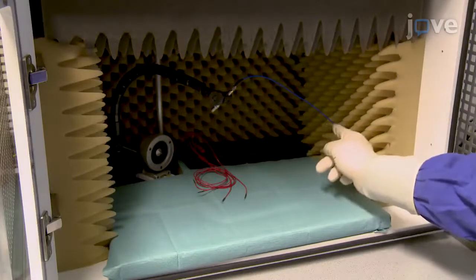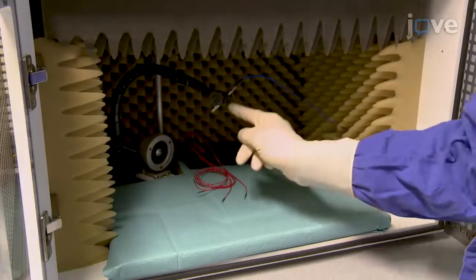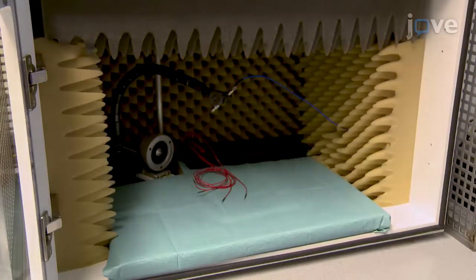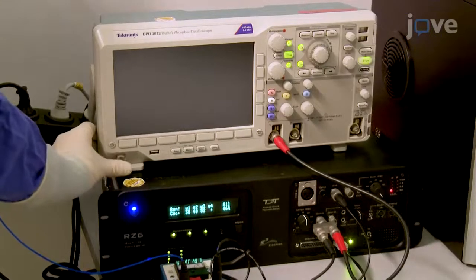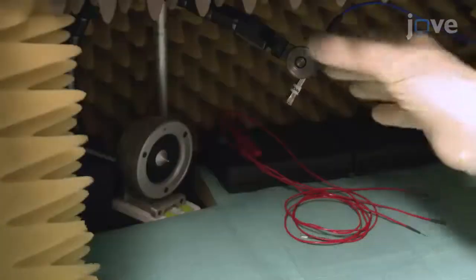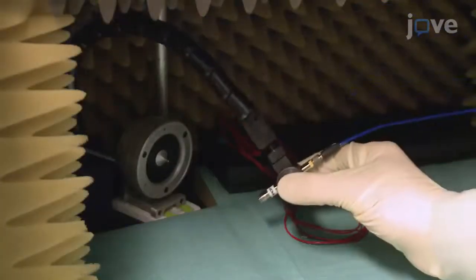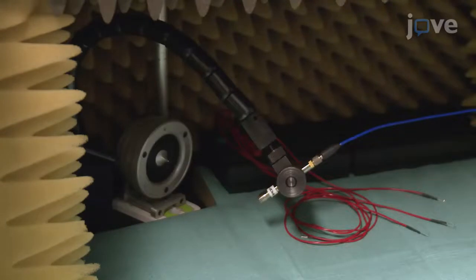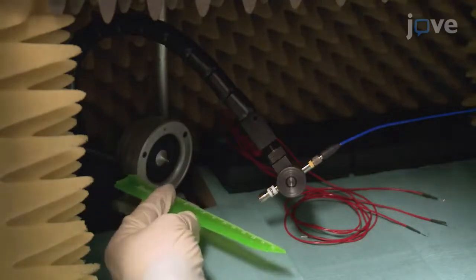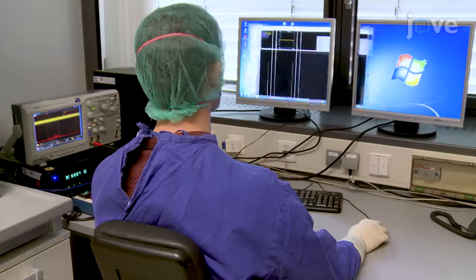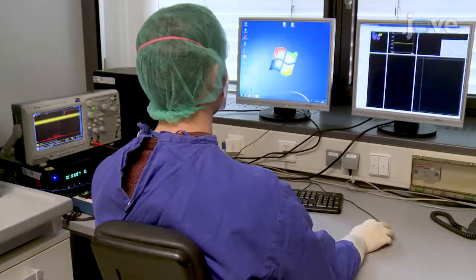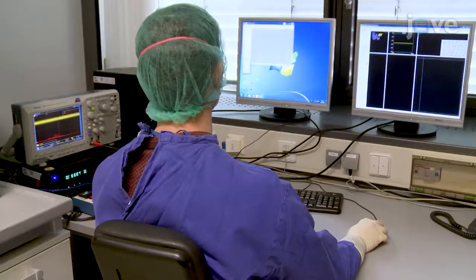Begin by turning on the pre-amplifier connected to the microphone at least five minutes prior to the calibration to allow for equilibration of the system. Turn on the oscilloscope. Then, position the microphone connected to a pre-amplifier inside the sound-attenuating cubicle to mimic the experimental murine ear. Next, open the commercially available processing and acquisition softwares and program the stimulus protocols for the clicks.